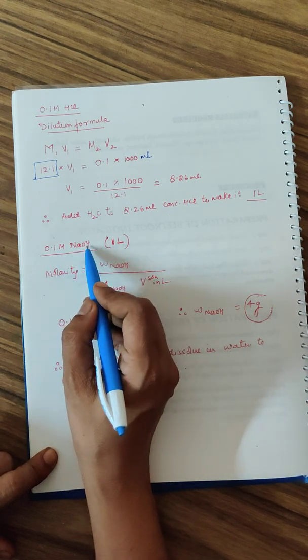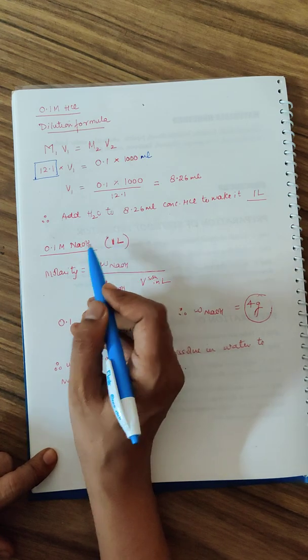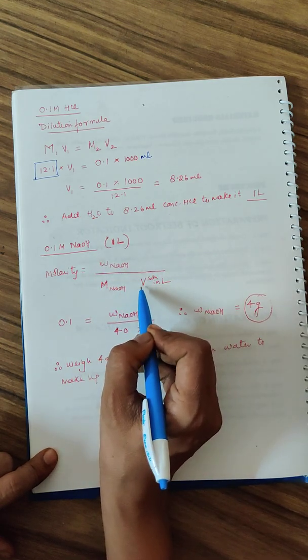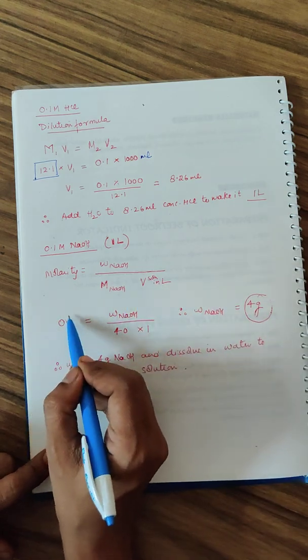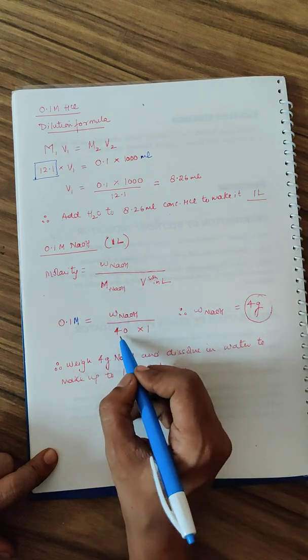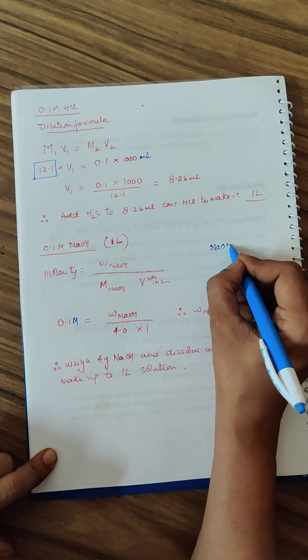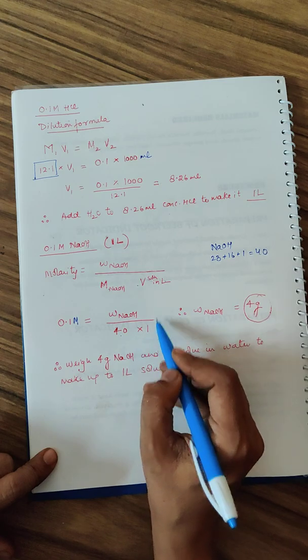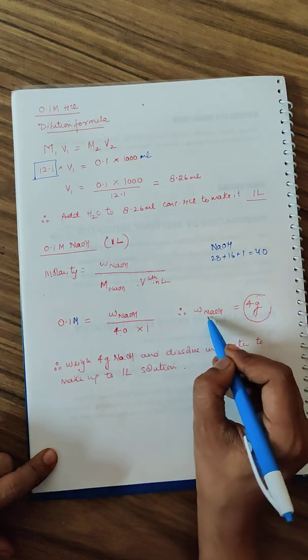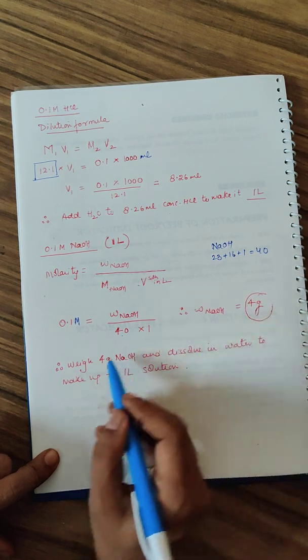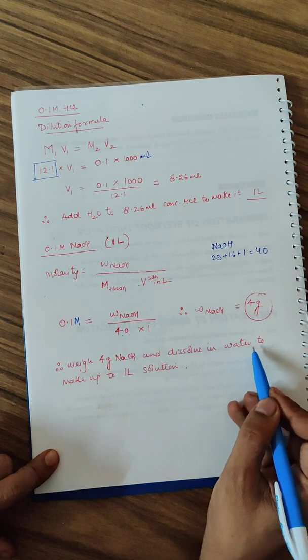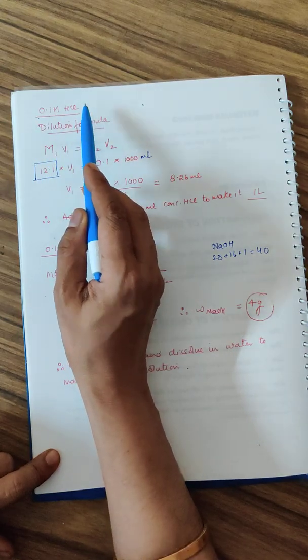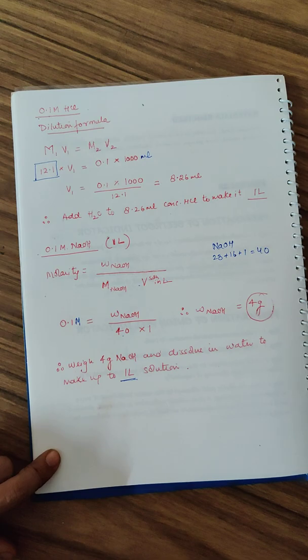0.1 molar NaOH - NaOH is not by dilution formula because you get it in solid form. The formula we use is molarity equals weight of NaOH needed upon the molecular mass of NaOH divided by volume of solution in liters. You are requiring 0.1 molar, 40 is the molecular mass of NaOH (23 plus 16 plus 1). Volume is 1 liter. The weight of NaOH that you require is only 4 grams. So you weigh 4 grams of NaOH and dissolve it in water to make it up to 1 liter.